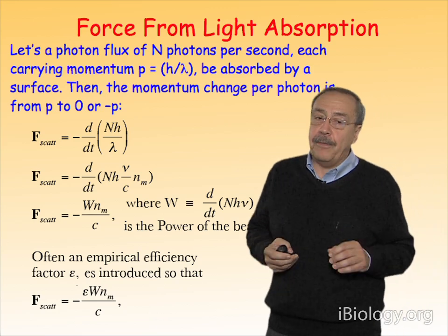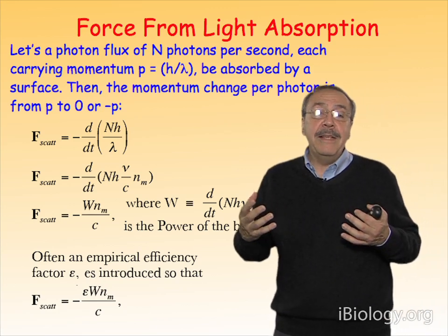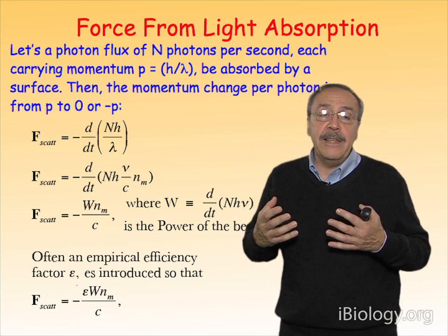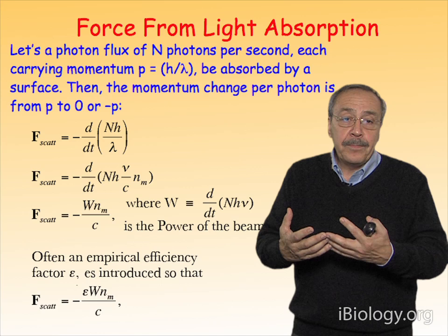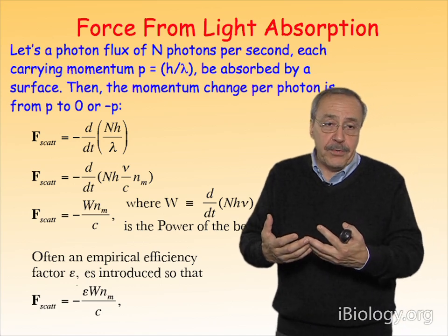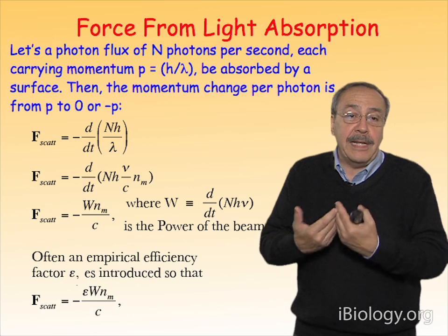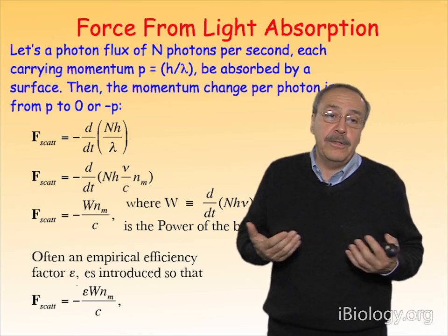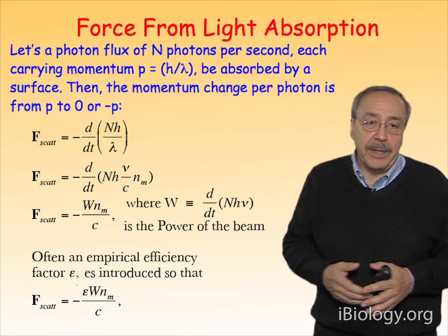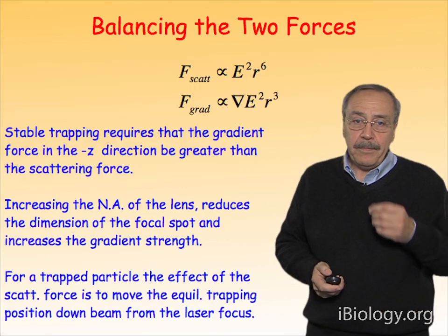But the important thing is the following. You see how the fact that light carries momentum means that if these photons are absorbed and therefore lose completely their momentum on a surface or on an object, the object or that surface is going to gain that momentum that the light had, and therefore is going to experience a force, given that the force is nothing but the rate of change of momentum. In other words, how the momentum changes in time.